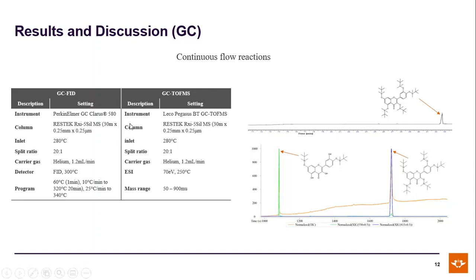The FID chromatogram shows a peak at about 30 minutes belonging to the derivatized quercetin. According to literature, it is known that quercetin has a boiling point of about 500 degrees Celsius, which, when compared to the maximum temperature of the column, which is about 350 degrees, this peak was observed at about 320 degrees, which shows that after quercetin has been derivatized, the boiling point has been lowered, thus it was observed at about 320 degrees compared to its normal underivatized boiling point of about 500 degrees.